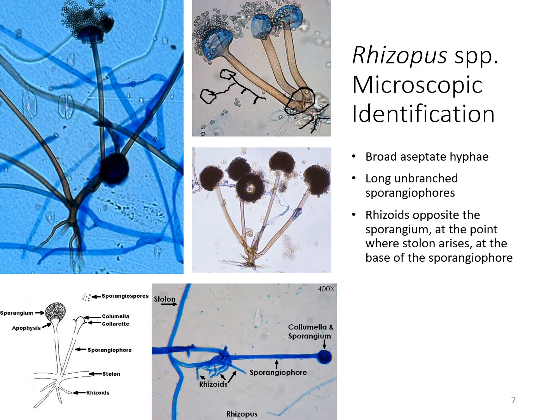What you're looking for in Rhizopus is that the sporangium, or sporangia for plural, are all coming straight over top of these roots, these rhizoids. You can see this image over here that they're doing the same thing. They come straight out of it. And so you're looking for the sporangium right over top of this root-like structure. That's what's going to be characteristic of the Rhizopus.